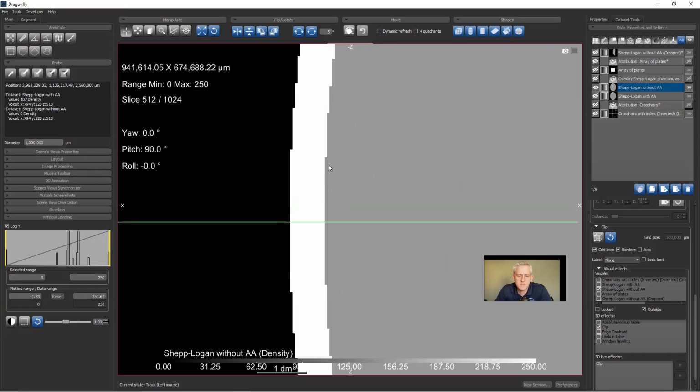So this has made a sub-volume. That's what a crop does. It makes a sub-volume, and you make the sub-volume on an integral number of pixels. So I could say I only want pixels 0 through 400 in the x-axis, but I can't say I want pixels 10.5 to 410.5. I can only use an integral pixel index. Now, that is very different from using the visual box.